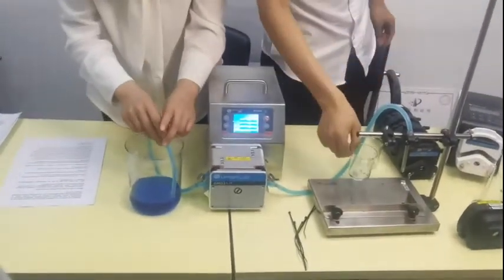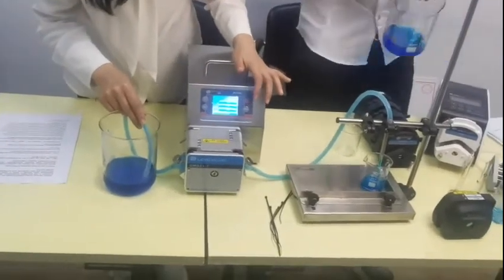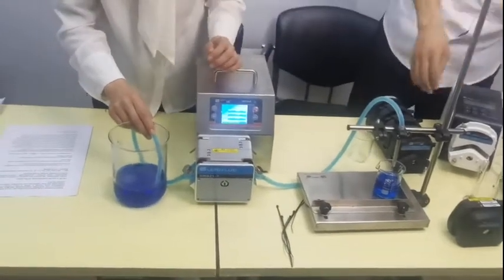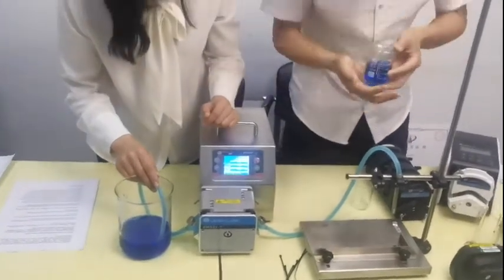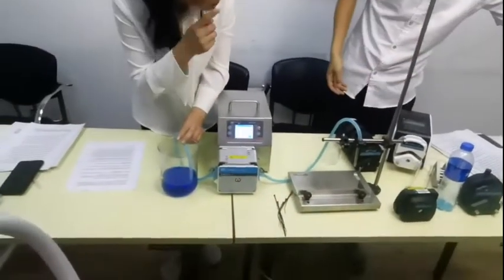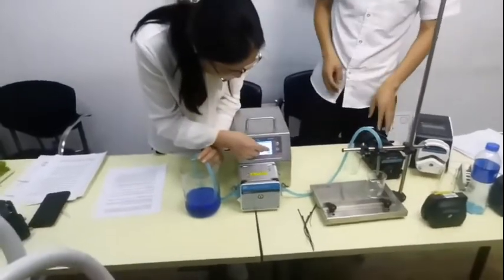Let's try another bottle. Can you read it for us? What's the volume? Volume is 70. The third is 70. So we put 70 in. We set 60, but it would give us 70, right? So we put the 70 in.